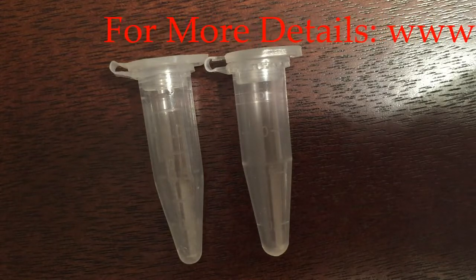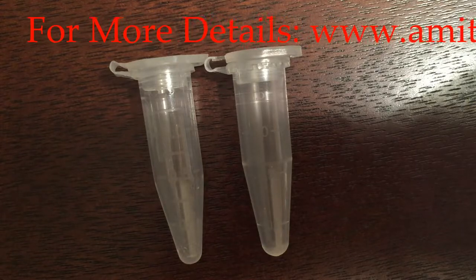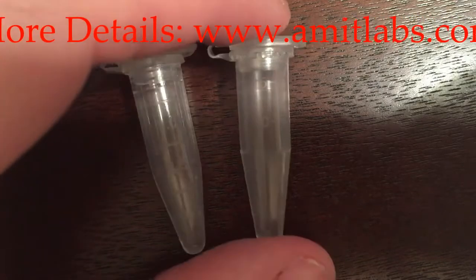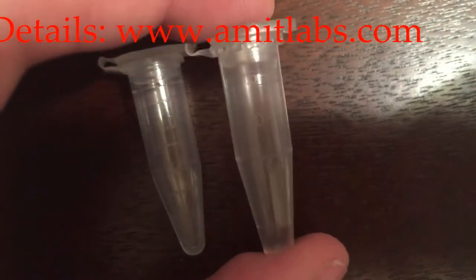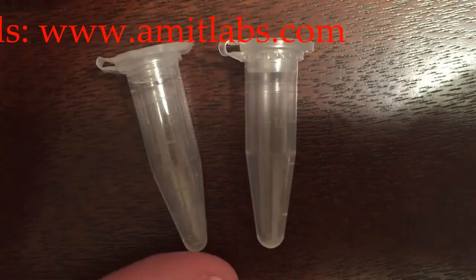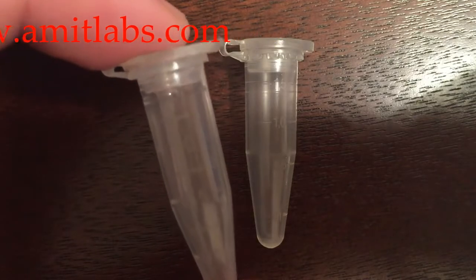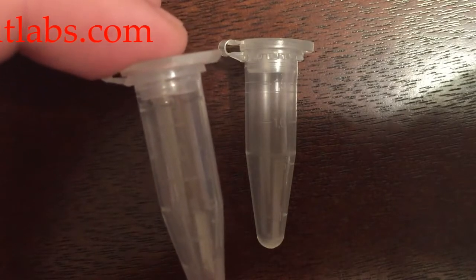You'll see right in front of us two microcentrifuge tubes that we carry. Both are graduated to 1.5 milliliters and at first glance look very similar. However, you'll notice that this Brandtek tube on the right actually has a little bit of space above that 1.5 milliliter graduation mark — the actual volume of this tube is about 1.7 milliliters. The other tube's graduation mark is nearly at the same level as the end of the cap.